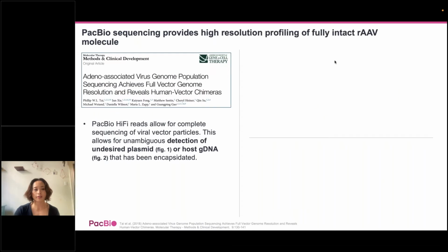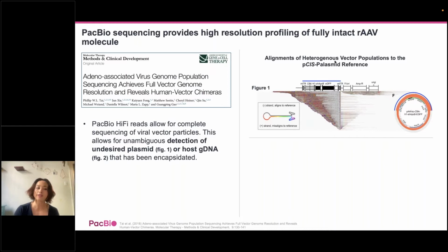In the second publication, the researchers used HiFi sequencing to sequence viral particles to detect undesired backbones. In this case, they were sequencing a self-complementary AAV. Shown here in this IGV visualization is the structure of this plasmid. The blue thick line covers the ITR to ITR region. If the packaging was clean and only consisting of what's between the ITRs, the reads, which are these gray lines plus the little rainbow colors, should only cover the blue region. However, as you can see here, the sequencing actually shows that there is detection of undesired backbone plasmid material.